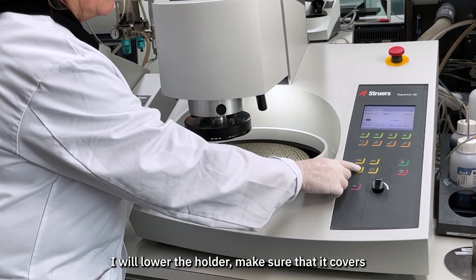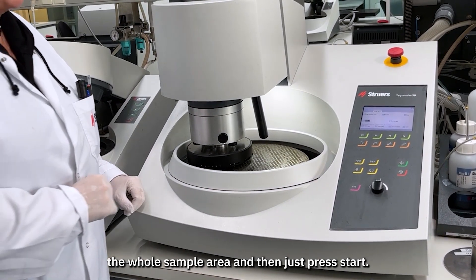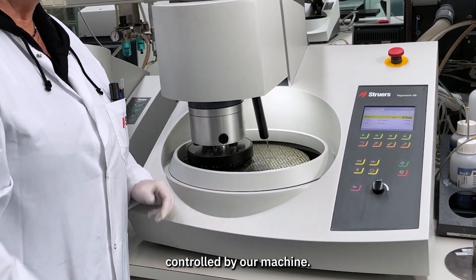I will lower the holder. Make sure that it covers the whole sample area and then just press start. All parameters are then controlled by our machine.